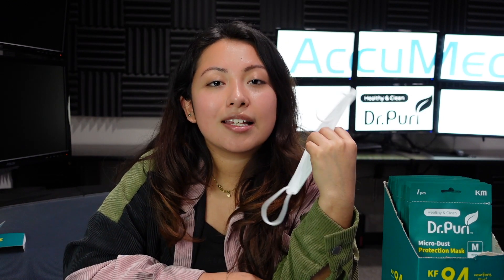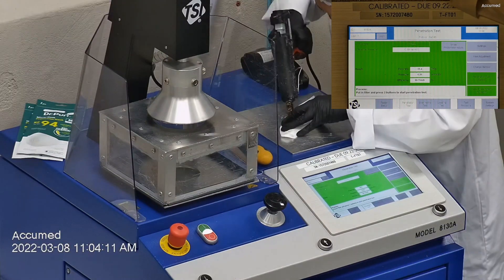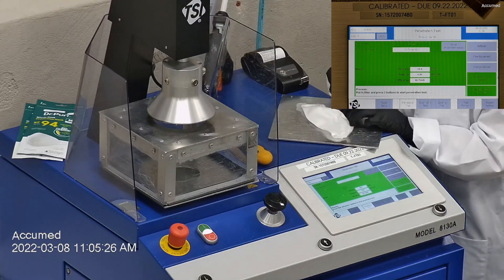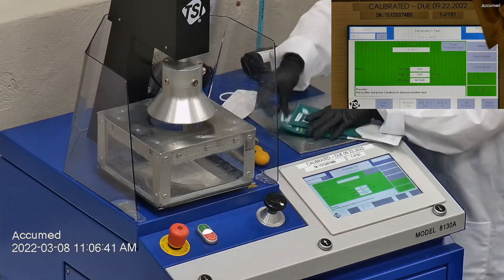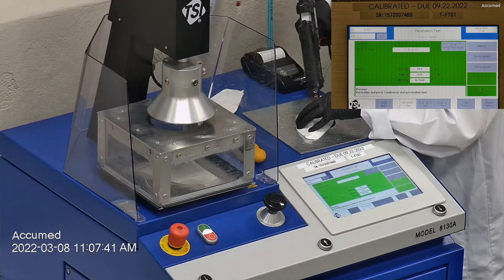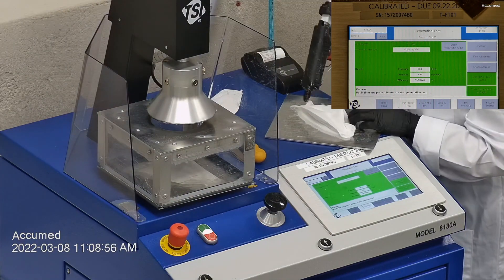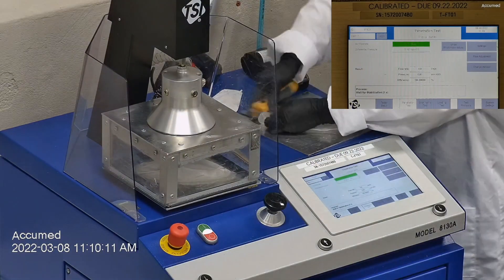With that said, let's see if they pass the filtration test with our TSI machine. We use it to test the particle filtration efficiency of a respirator or mask. Our testing procedure is inspired by NIOSH. We first remove the band before placing it on the testing plate to ensure a proper seal, then make sure the mask is completely sealed with hot glue to the testing plate. The testing plate is then attached to the frame, and the box is placed under the TSI filter holder. We will be testing three samples to acquire the most accurate information.